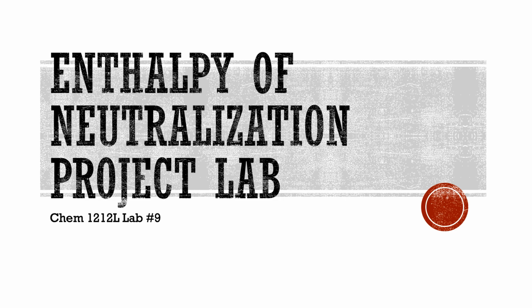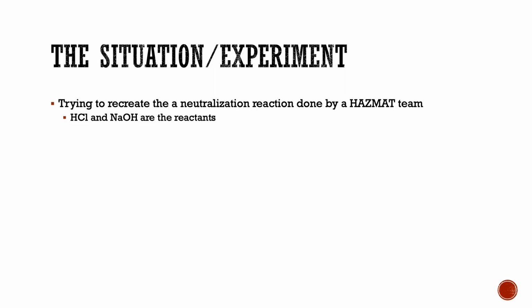Now, in terms of the lab itself, you are going to be taking a look at the enthalpy of neutralization. Hopefully that sounds a little bit familiar, because if you took 1211 lab here, you probably did an enthalpy of neutralization lab in 1211. So there are going to be some similarities there. In terms of what you're going to be doing in the lab, or if you've looked at CSE Pub, you're going to try to verify other people's results.